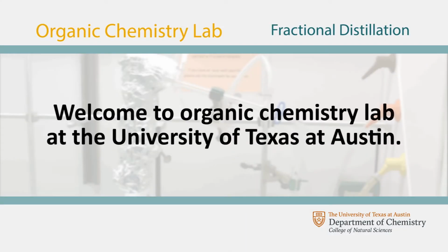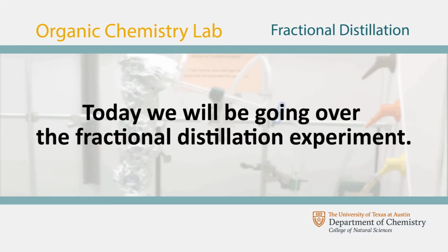Welcome to Organic Chemistry Lab at the University of Texas at Austin. Today we will be going over the fractional distillation experiment.